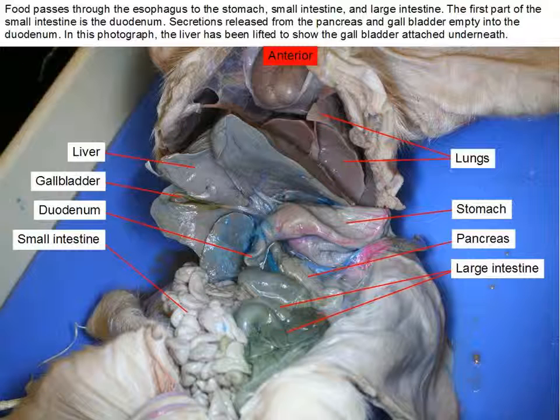And when you're talking about the digestive system, normally you're going to work on a piece of food for a while, go through specific functions, toss it around, mix it with acid, say in the stomach, and then pass it along to something else that does a different thing to it. Extraction, dilution. The large intestine, for example, takes water out of the sample. Okay, that should be all that.